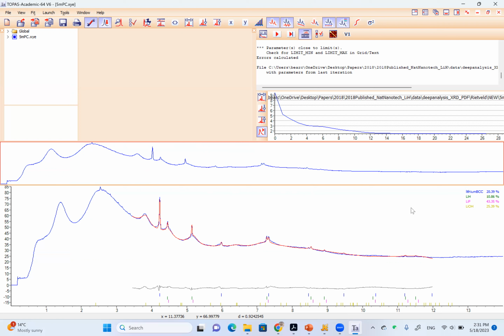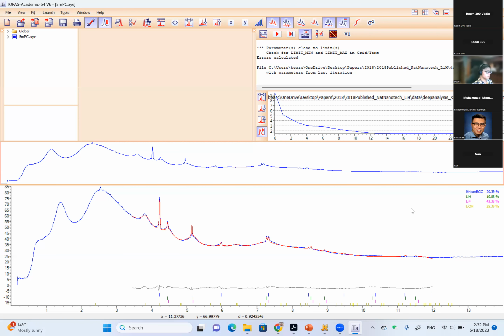So we can just first tell the software, I directly tell you, this is this metal and this is that parameter, and do not care anything about this metal. Focus your attention on other things. That will make your refinement much more stable. Okay, so this is one of the strategies or tricks that you need to keep in mind.